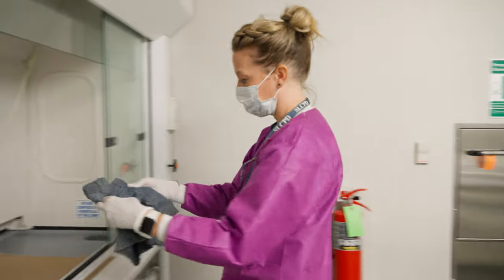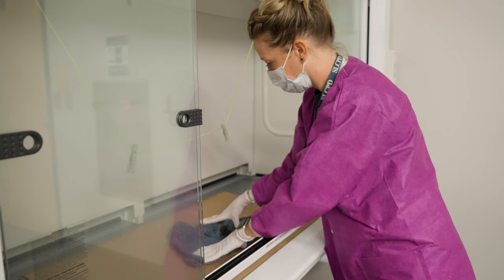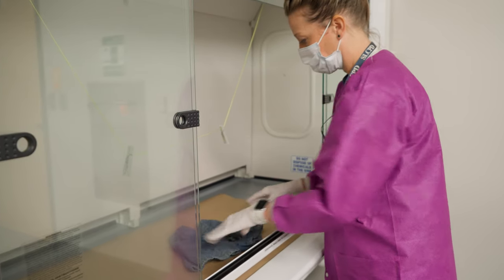Another commonly used reagent to detect blood is luminol. Luminol is used as an investigative aid to detect blood that is not visible with the naked eye. It is commonly used to detect blood at crime scenes that may have been cleaned up.